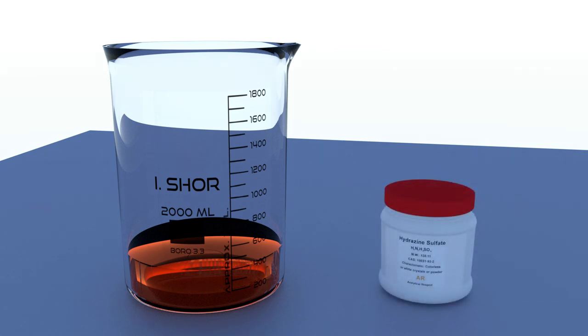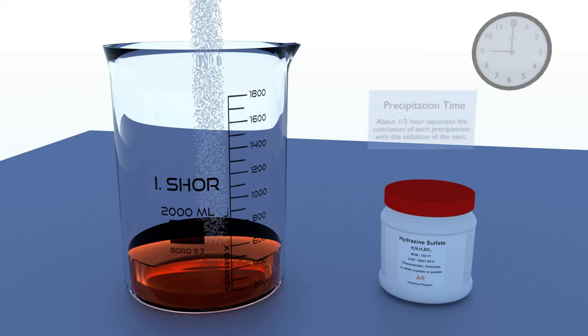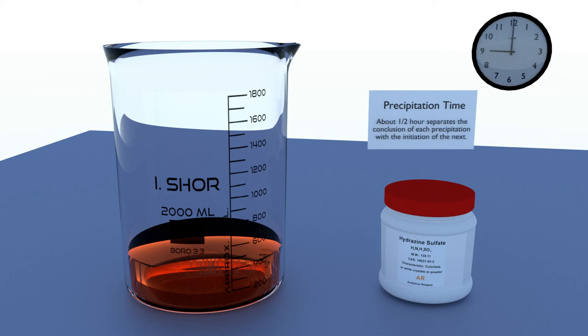Add hydrazine. The amount required is the same as the total weight of your platinum group metals. The various platinum metals - platinum, palladium, rhodium, iridium, and so on - will precipitate in different time frames, with about one half hour separating the conclusion of each precipitation with the initiation of the next. Recover each PGM at the conclusion of each precipitation, then set aside.